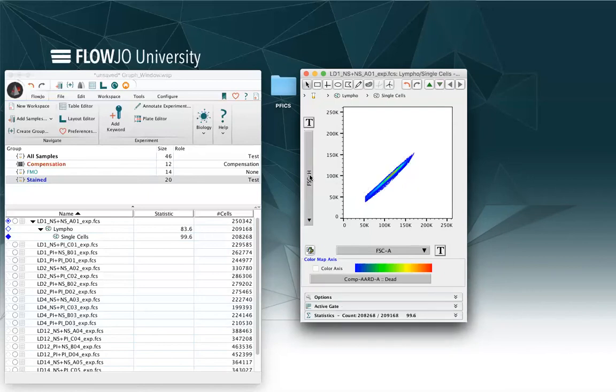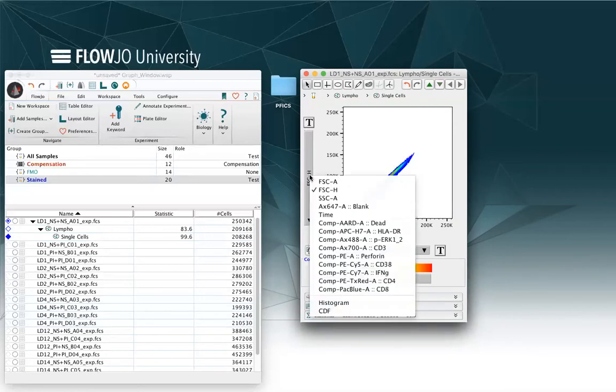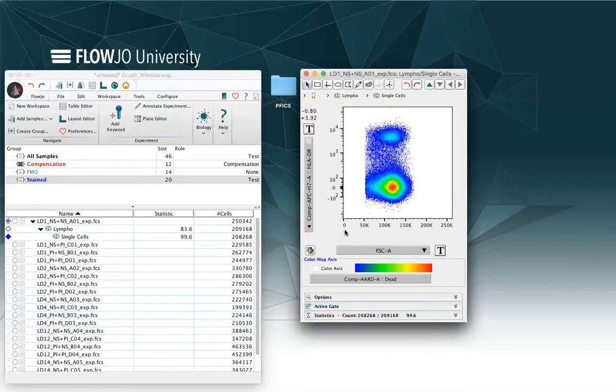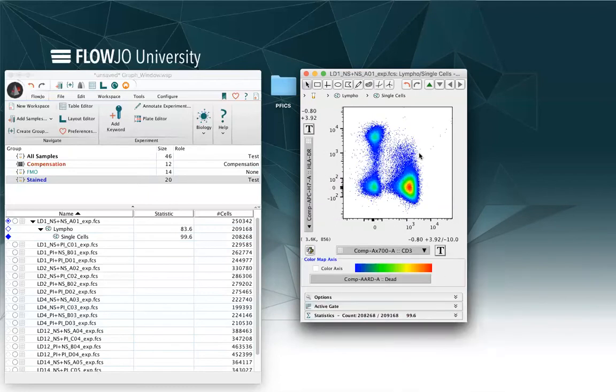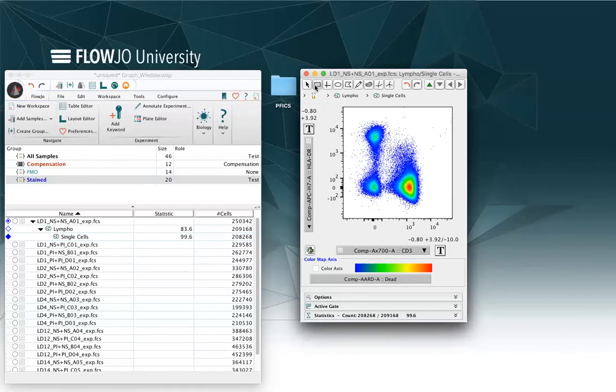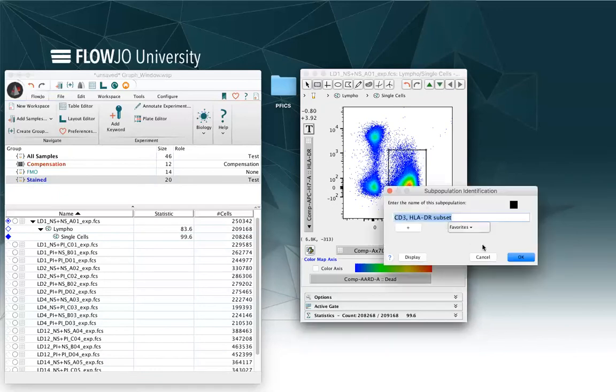If I open up a third graph window, I can select different parameters, for example, DR versus CD3. And in this case, I will have several options of creating a gate. I can select the rectangle gate and give it a name.